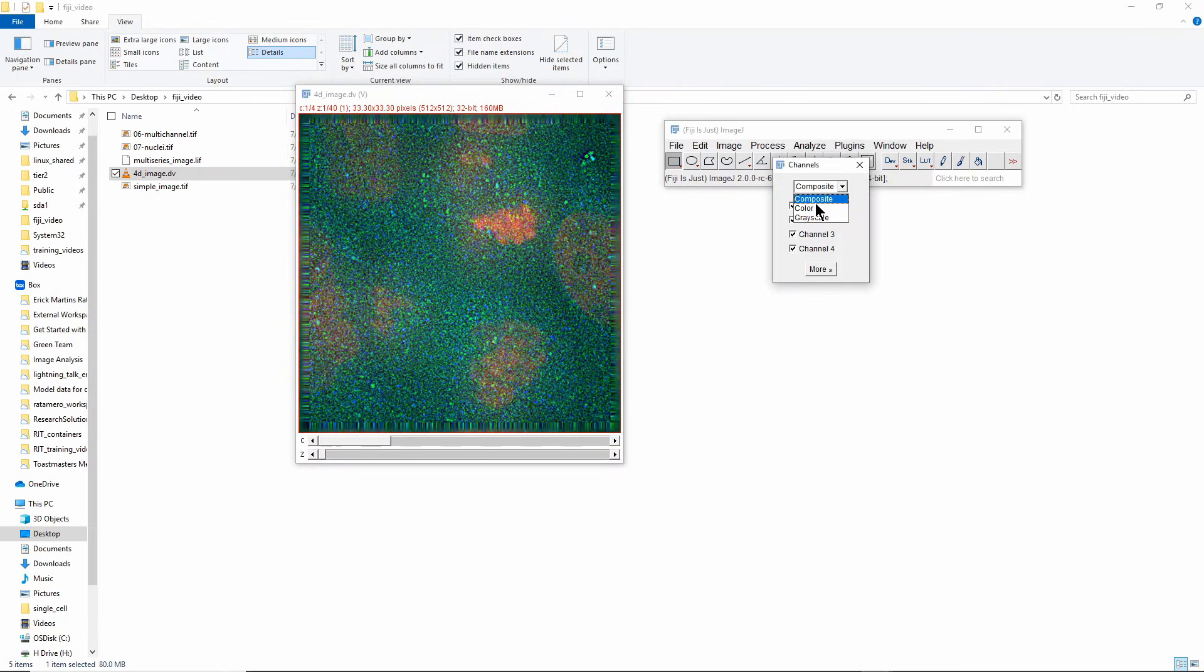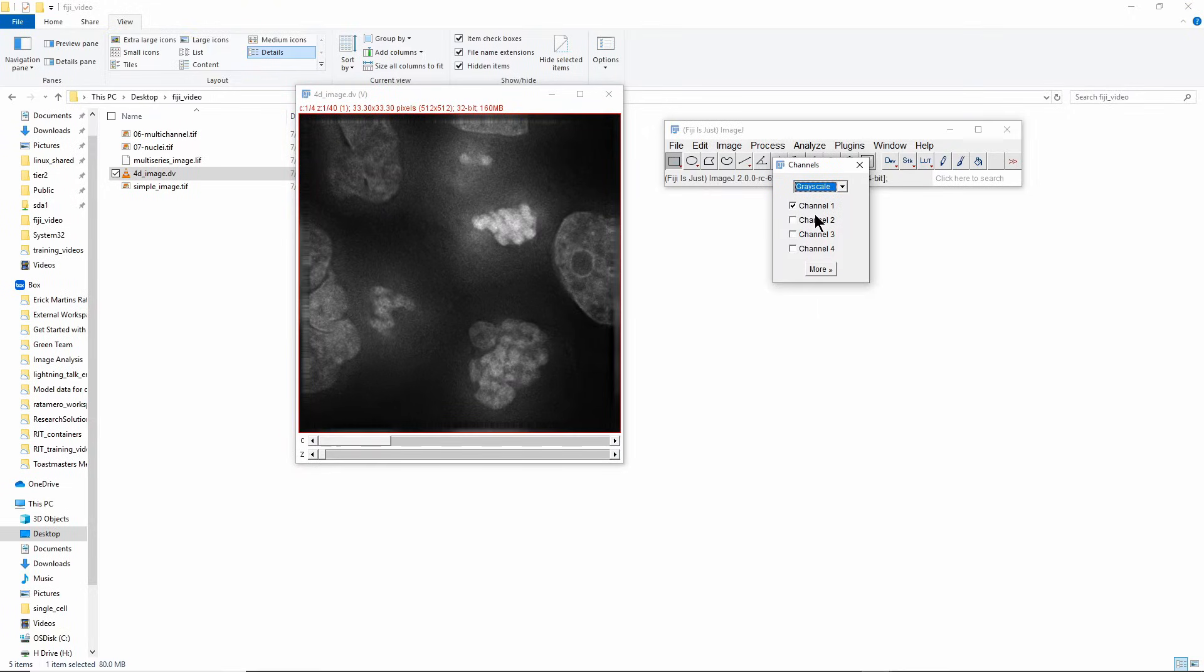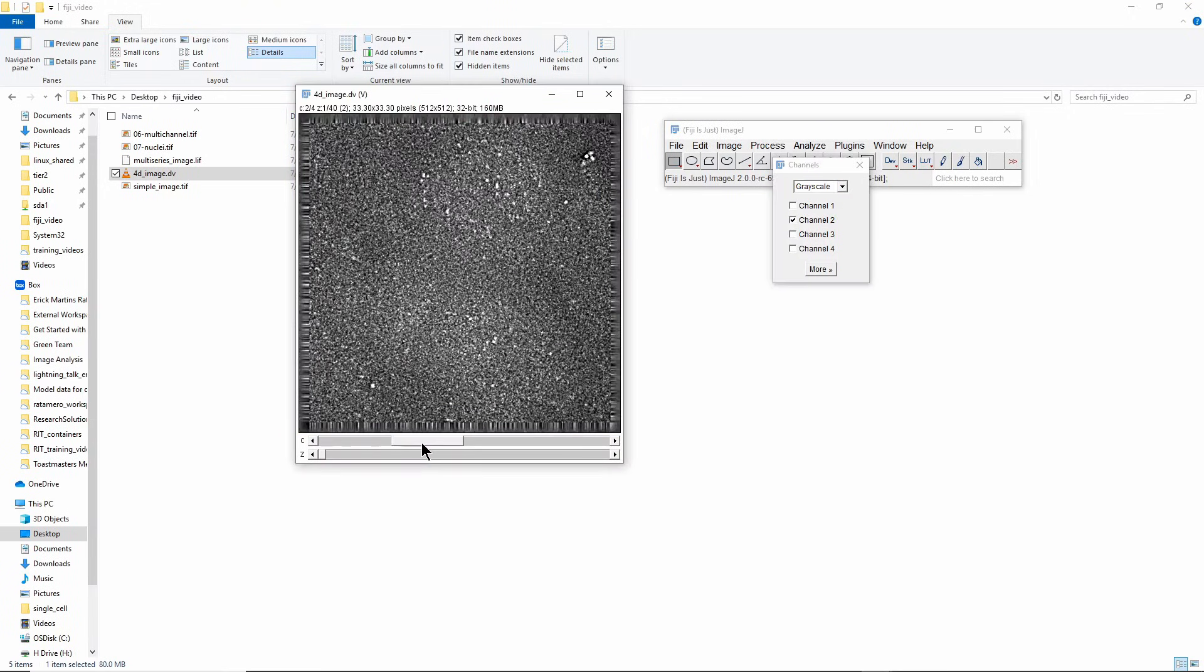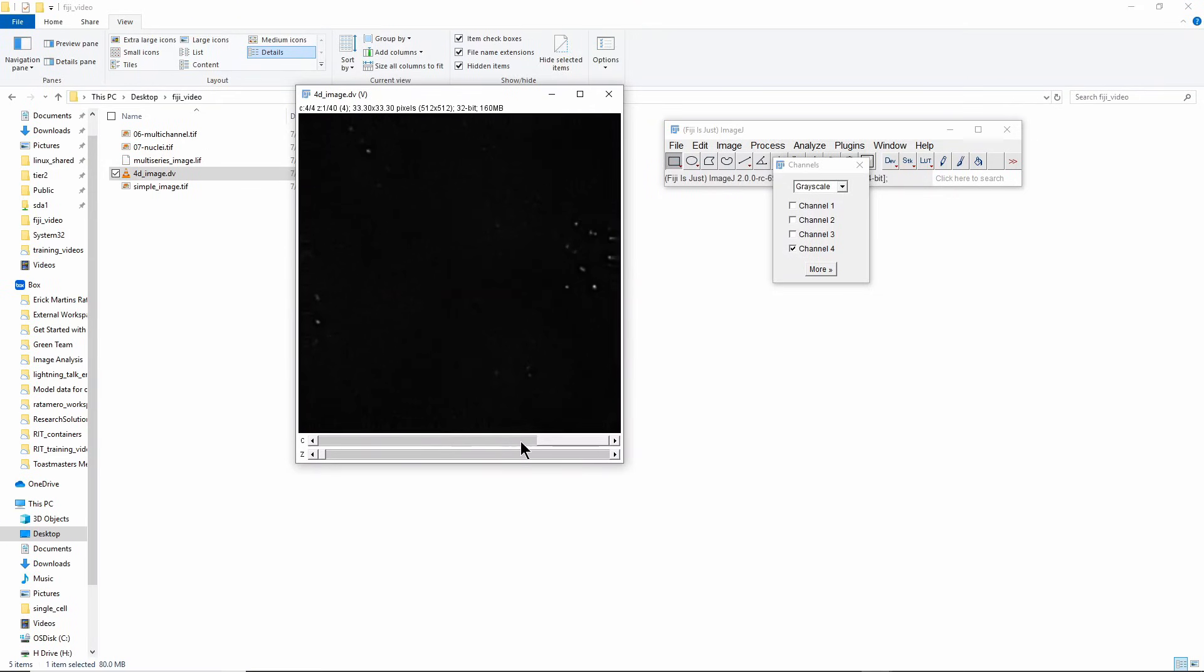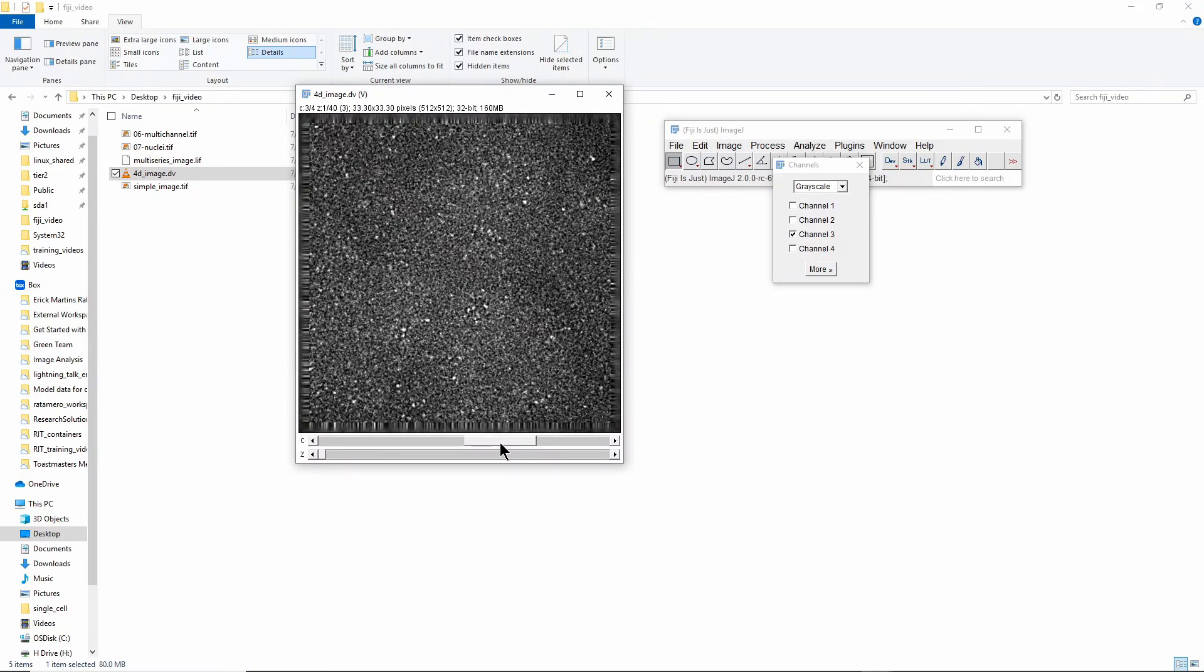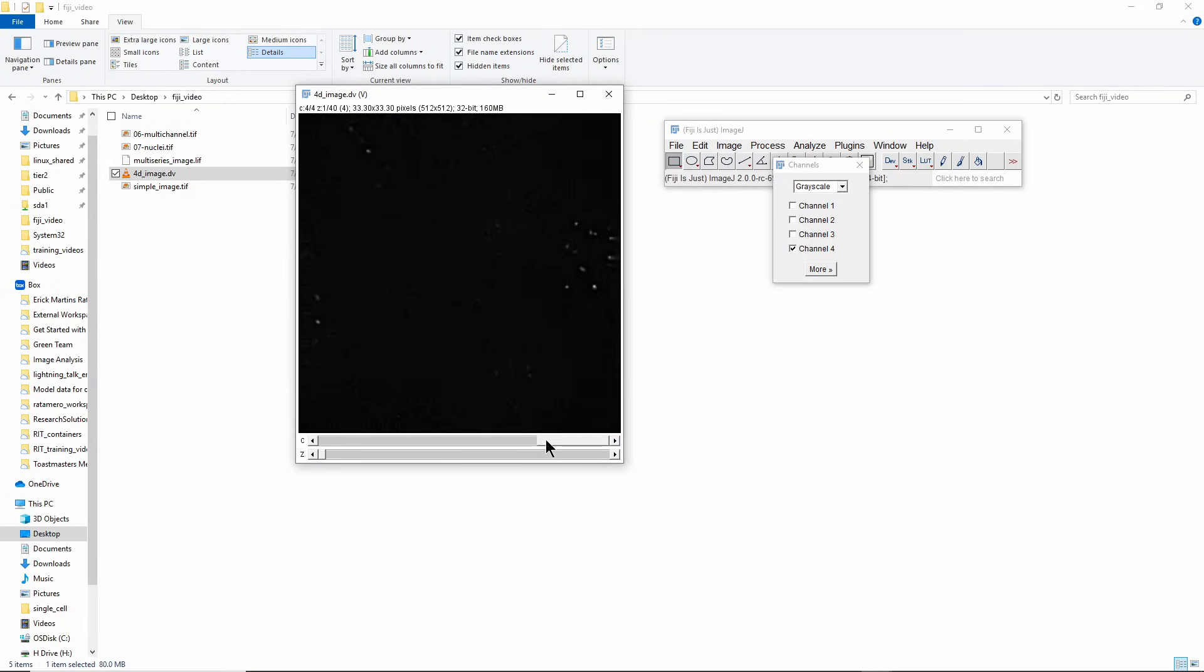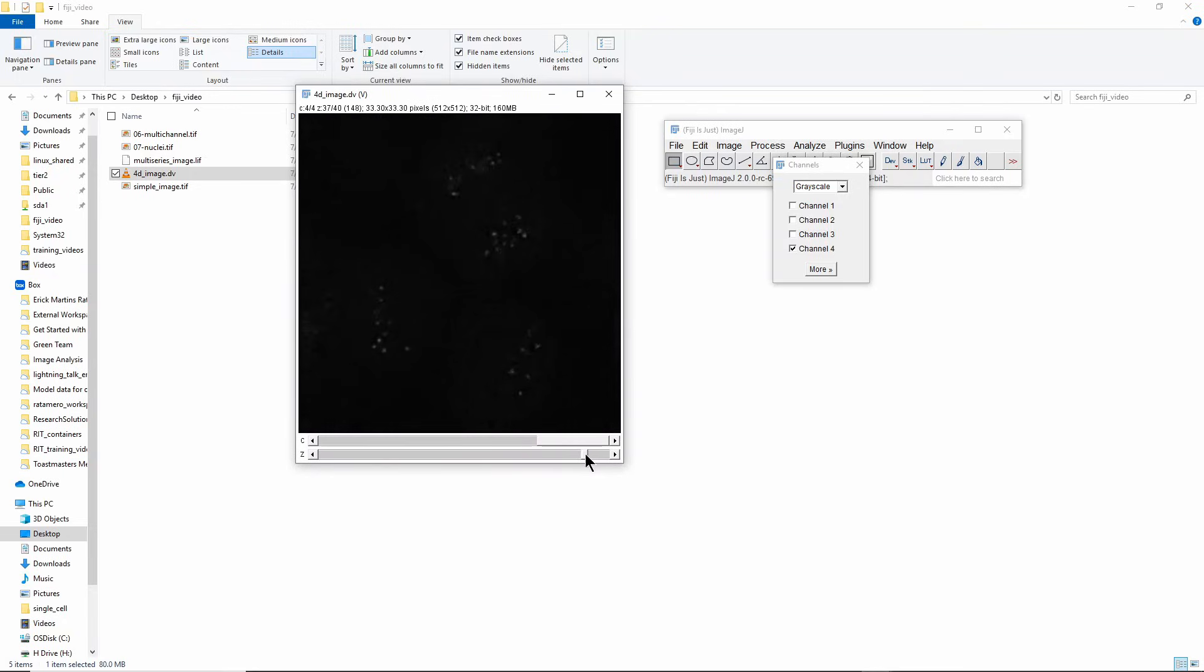Alternatively you can choose instead of Color, you can choose Grayscale, and then every channel is going to be displayed in grayscale. That's normally the way I prefer to visualize things because you actually get a better contrast visually by doing things in grayscale rather than in red or green or blue.